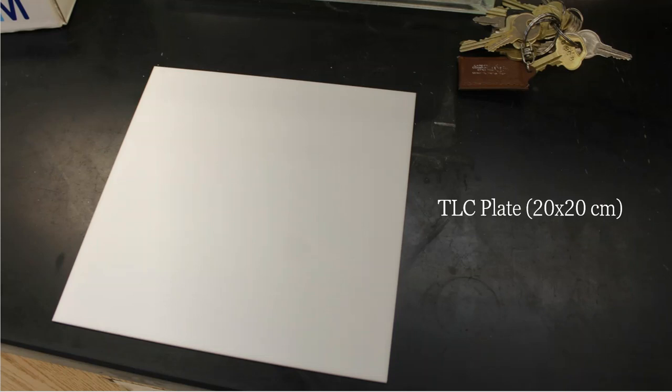So this is a TLC plate. For size reference, you can see my wad of keys at the very top. These are pretty large, 20 by 20 centimeters. They are a square plate, and they do have a glass backing. Again, I like the very rigid ones. I don't like people grabbing a hold of these and bending them so they become flexible. It just damages the surface of the plate, and I don't like that.